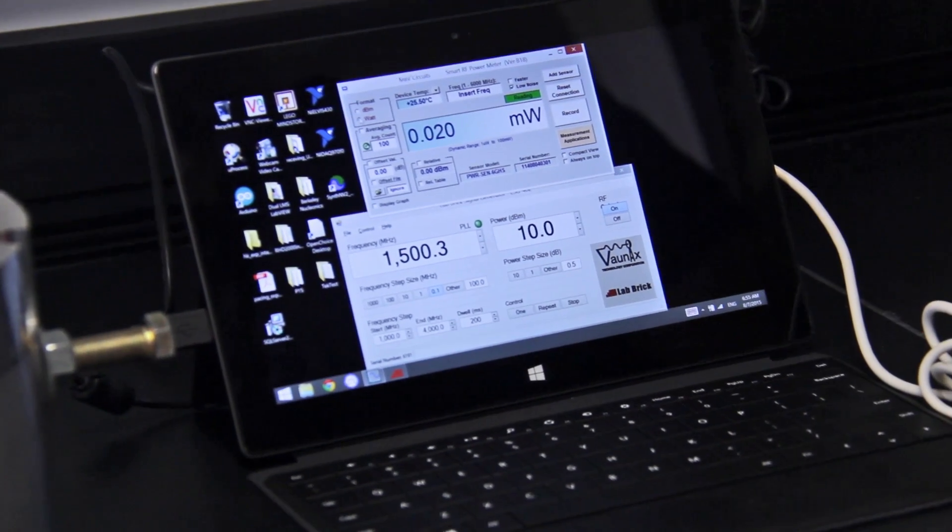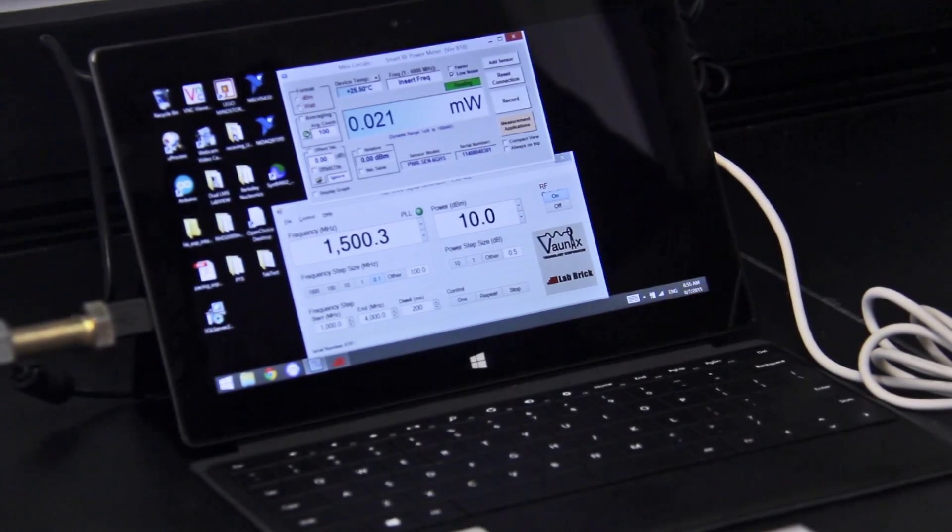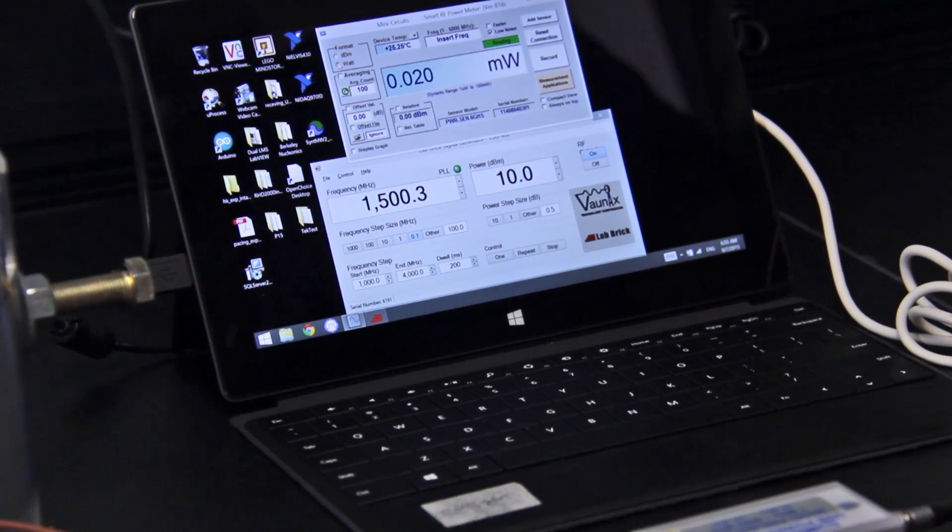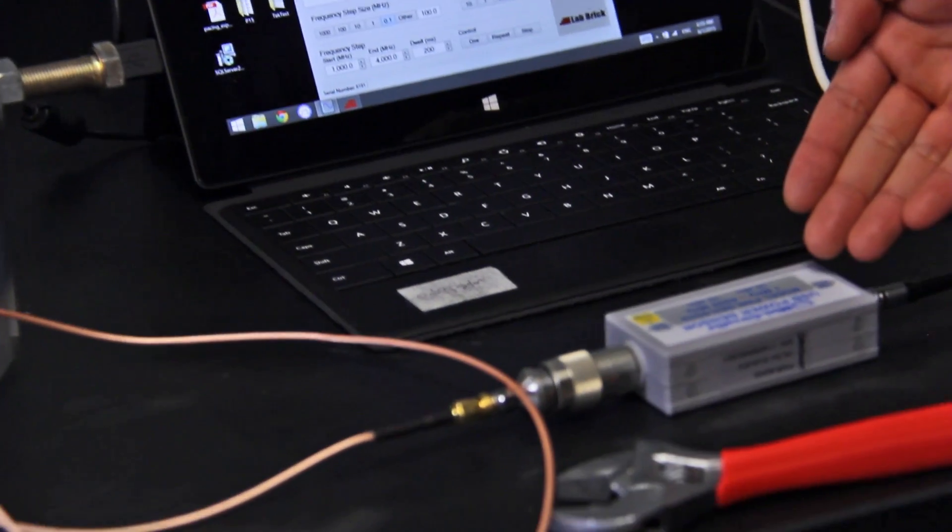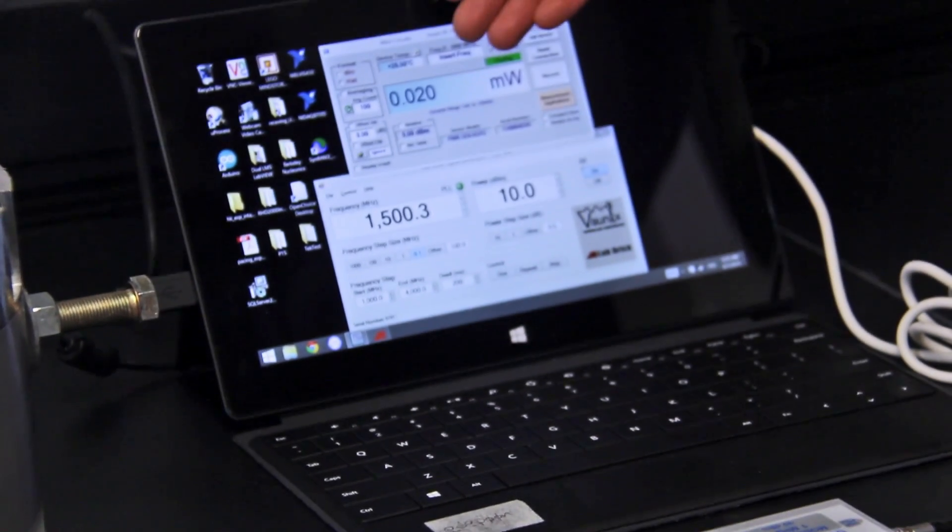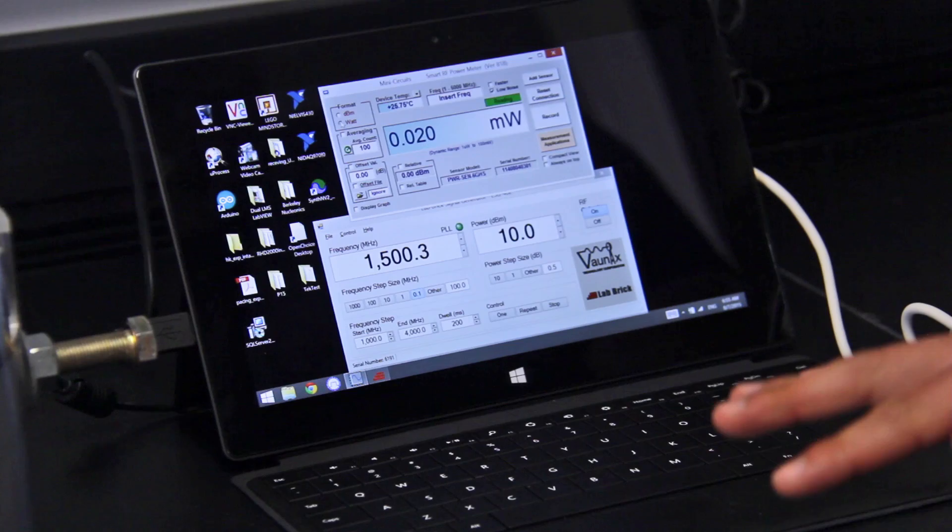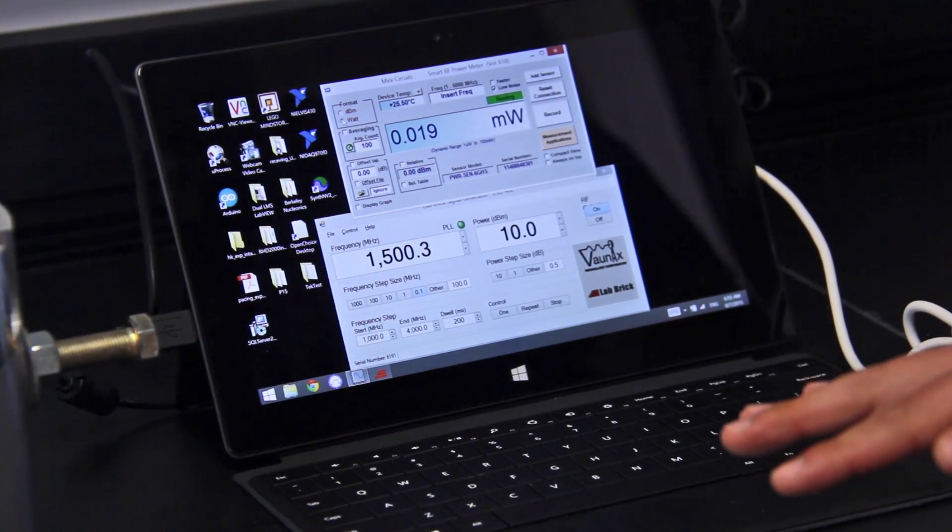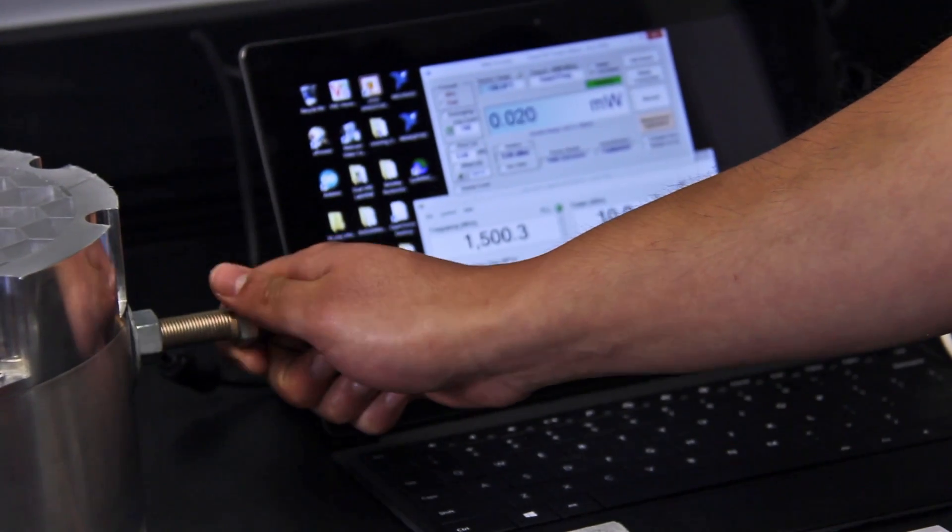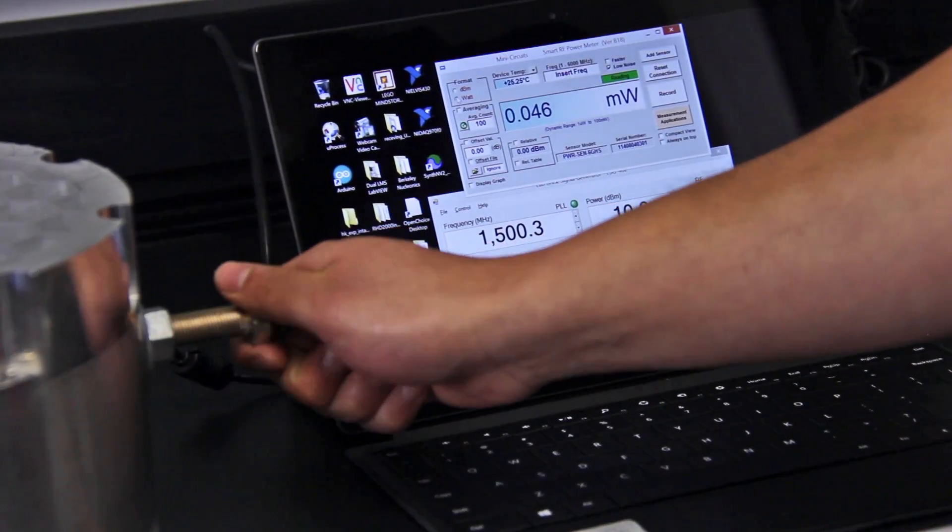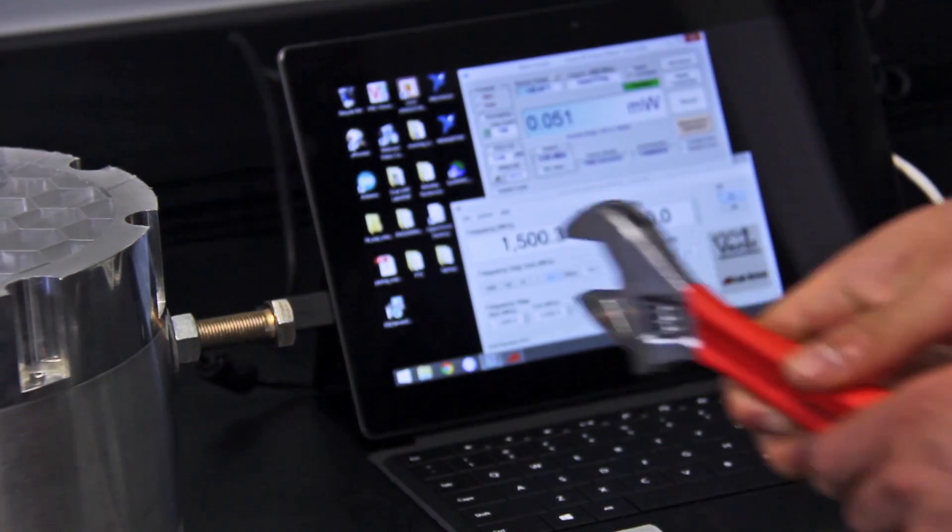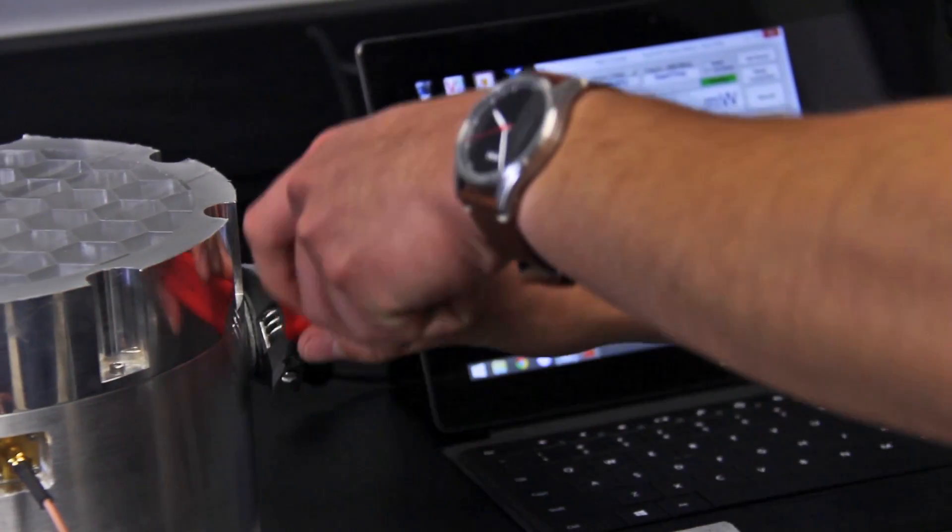Next comes the optional step of confirming that the cavity is operating at the optimal frequency. To do this, I use this USB power sensor. Here you see the reading that's being picked up by the sensor. Optimally, we expect about 0.06 mW. And you can see that as I tune the cavity, this number will increase. And now tighten it with a wrench to make sure there's no leakage current.